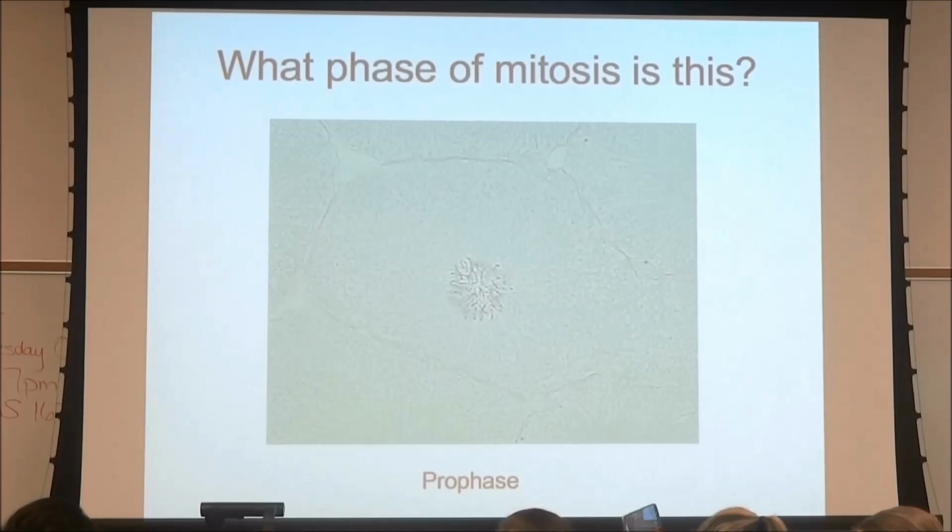Okay? The genetic material is there, but the nuclear membrane has disappeared. Will we be seeing this like a sheet of paper, or will we go through a microscope? Microscope. Yeah.